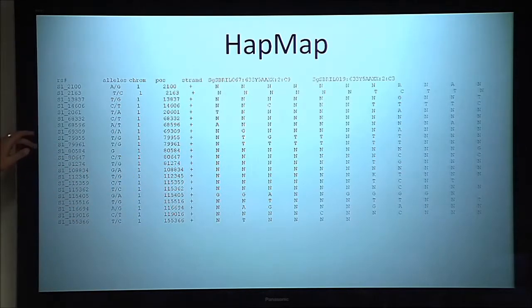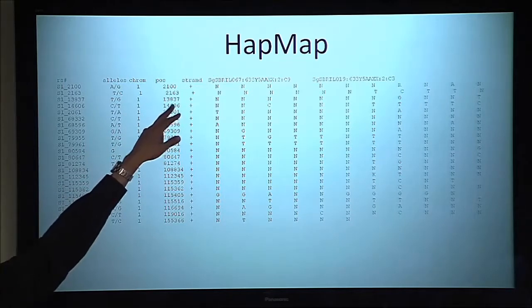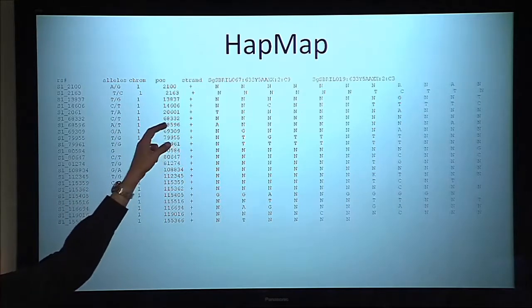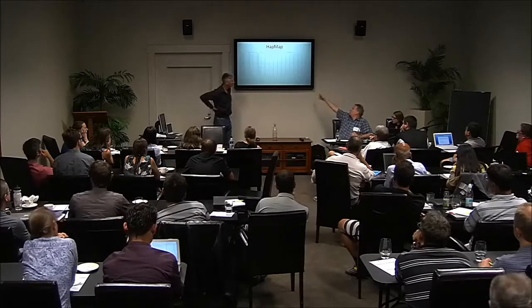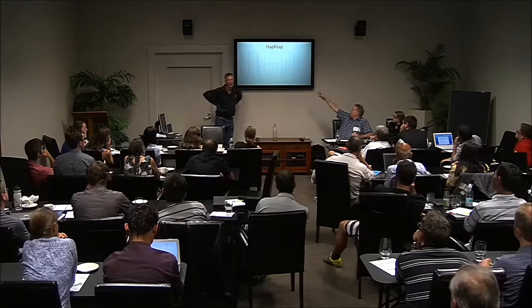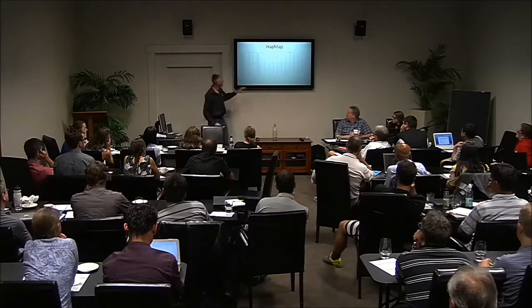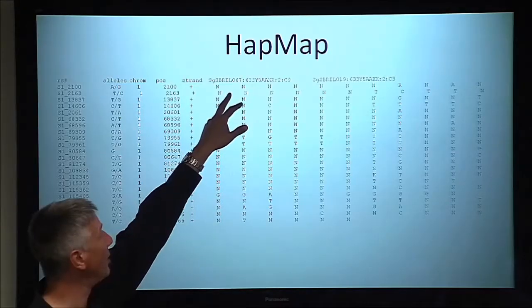This is the site, so it's site1_2100. So this is kind of a coding for this, but you can see where it comes from. There's chromosome 1, position 2100. Okay, and then it has either A or G alleles. Now this table goes really far out, so you don't see necessarily all of this stuff here. But what you do see, each of these columns is a taxon or sample's genotype, and there's only 2 names shown here, but there's actually as many names in the file as there are columns of genotypes. But this is one of those deals when you're working with a text file and things get a little bit skewed. So the names here, you'll see, this would be the sample name, is SGS-BRL 067.